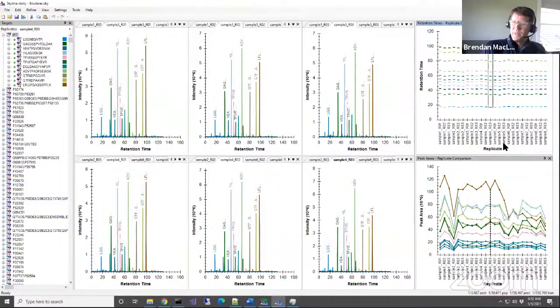We did 24 runs, and these are the retention time standards, and yeah, should be similar across replicates. Exactly. Sometimes I even think of what would I expect, and then what's the ideal thing. The best possible thing would be, wow, these things are just straight across, right? That would mean there was no chromatographic shift of any kind.